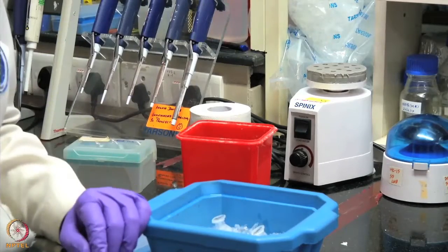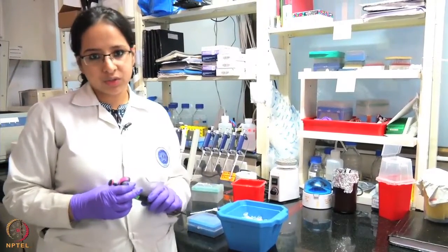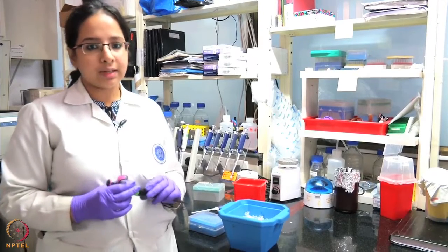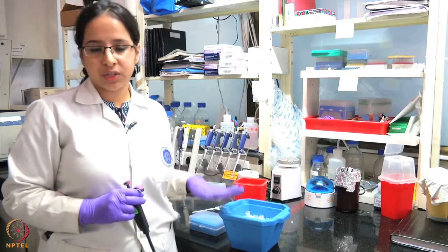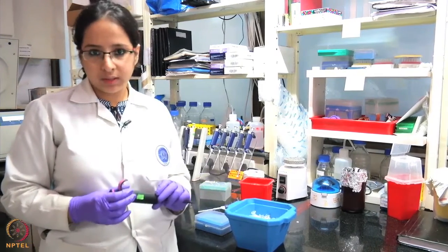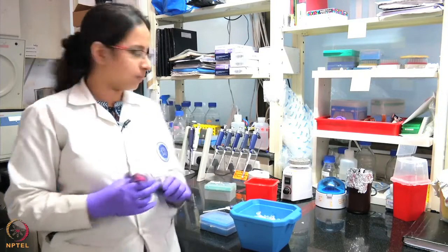Throughout the process, we need to make sure that it's carried out under aseptic conditions. So the tips should be autoclaved, and the tubes also should be sterile. At the same time, we should carry out the entire reaction on ice. Right now, I have made the restriction digestion cocktail for the vector. I'm going to do the same thing for the insert, and then we will keep the tubes at 37 degrees, which is the optimum temperature for the enzymes to act.